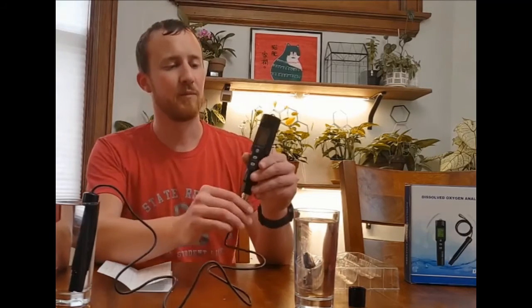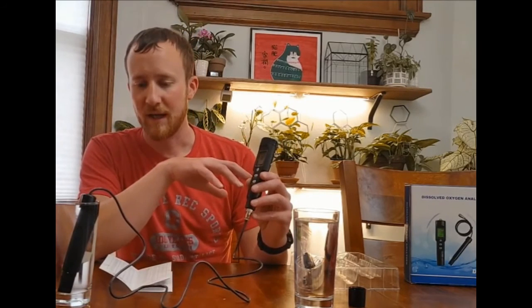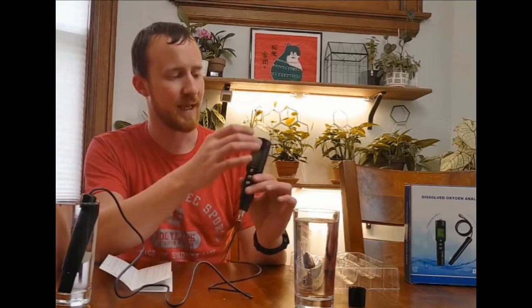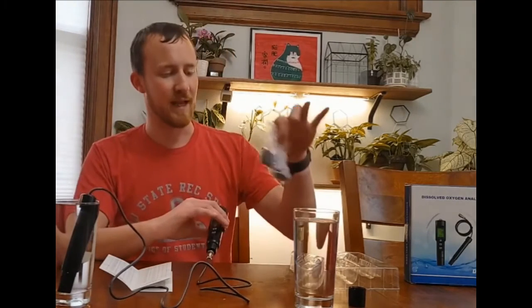Overall, it does seem to be working pretty well. It's a nice compact design. This comes out. It has replaceable batteries. It has a bunch of extra filters. Everything stores in the box you got it in nice and easy.